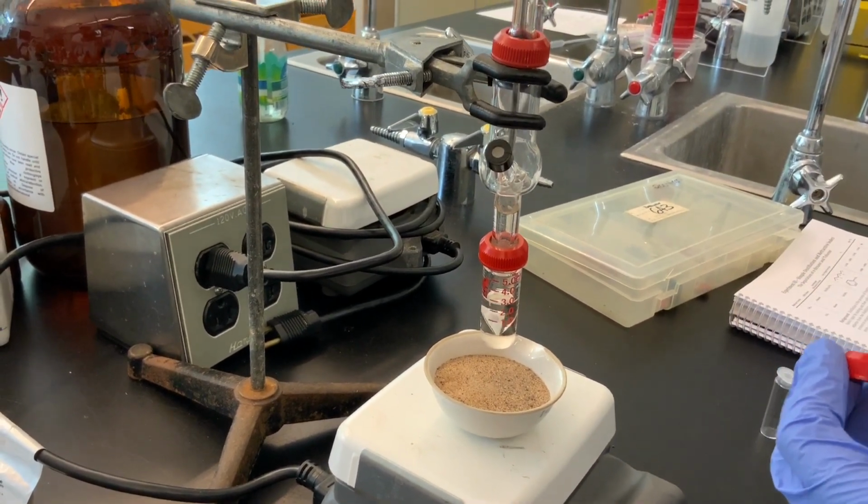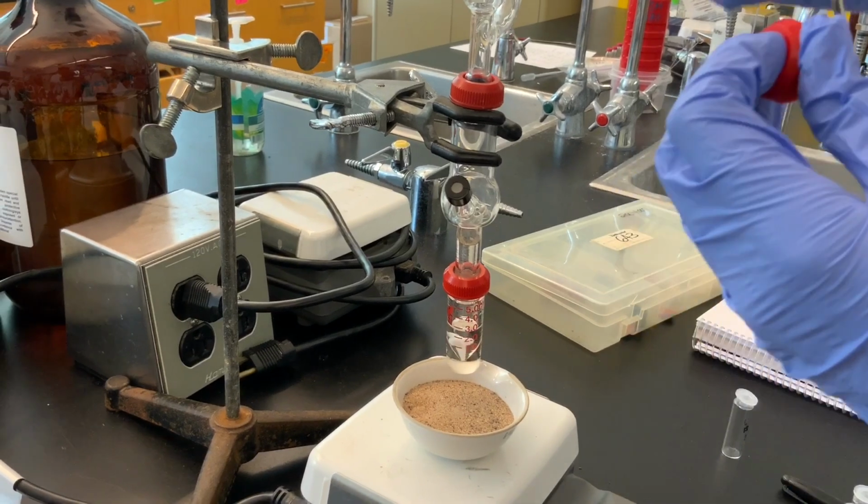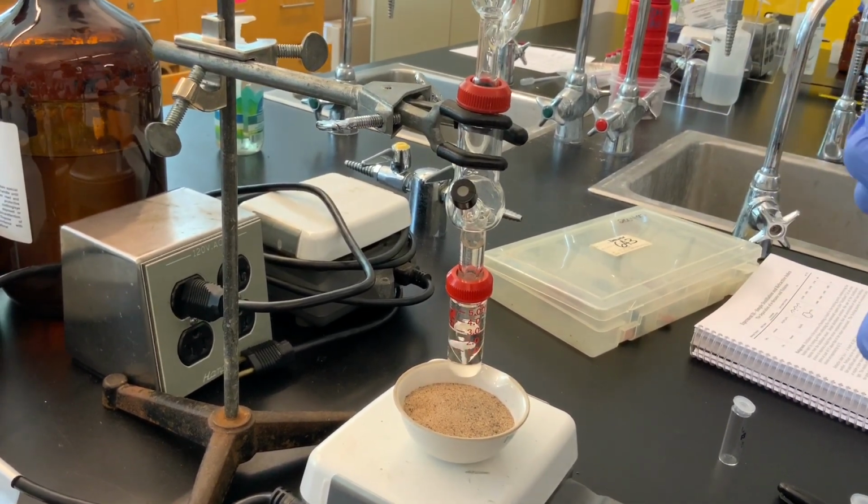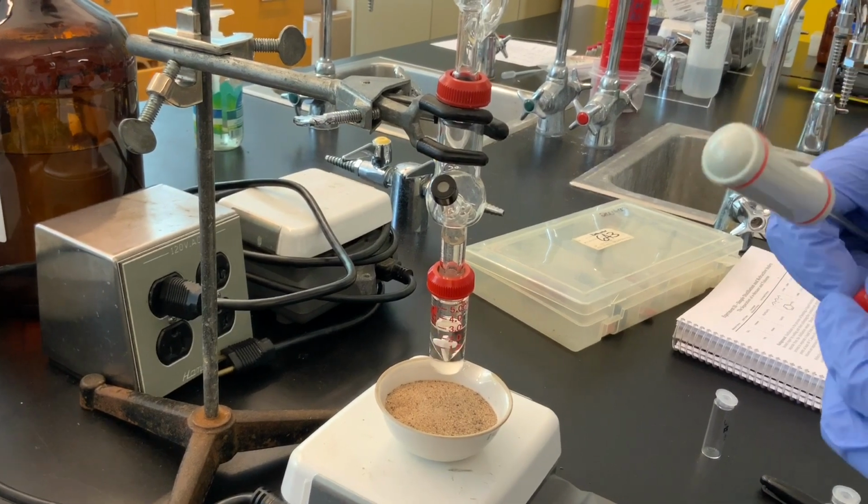So I want to know the temperature of the vapors that we're collecting, so that we can report a boiling point range for each of the fractions that we collect.